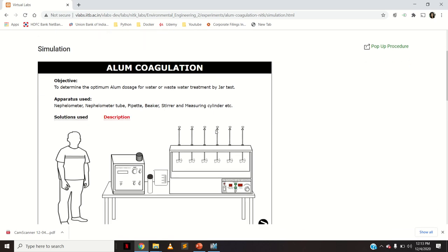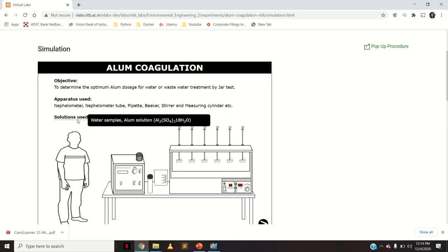The objective of the experiment is to determine the optimum alum dosage for water or wastewater treatment by jar test. The apparatus used includes a nephilometer, nephilometer tube, pipette, beaker, stirrer, measuring cylinder, and the jar test apparatus. The solutions used are the water sample and the alum solution.